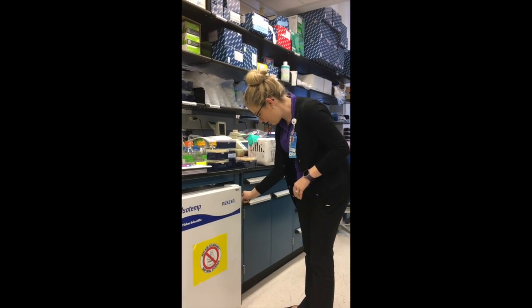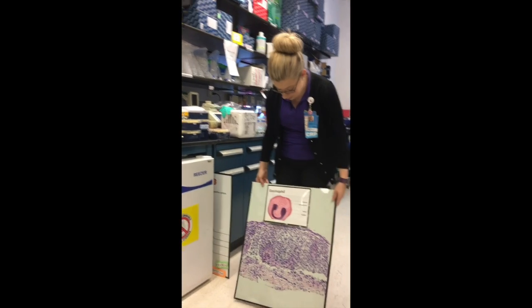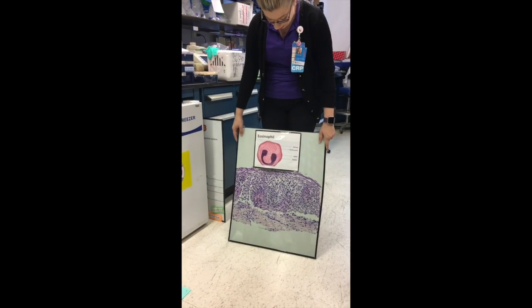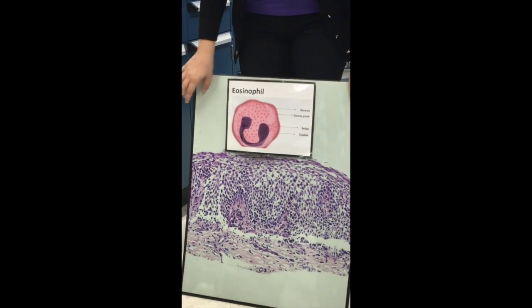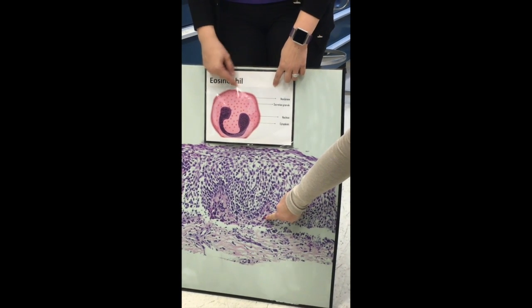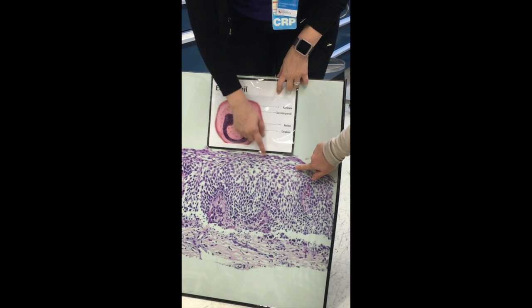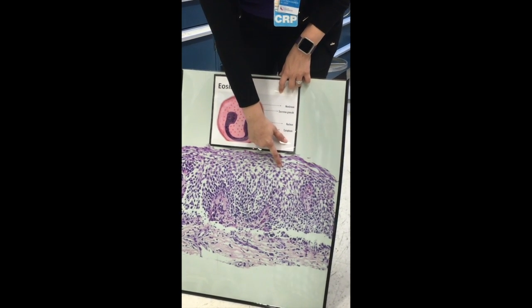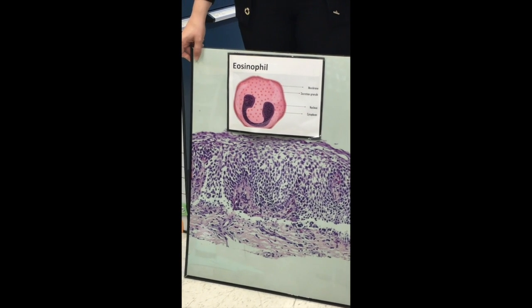I have my awesome big picture here. Let's see. That's a biopsy. This is what we look at when we're looking at your eosinophils. That's an eosinophil there. Yep. So right in here, the big pink ones. Yeah, so that's a big eosinophil. The picture is that little square under a microscope. Yep. And this is what they count.